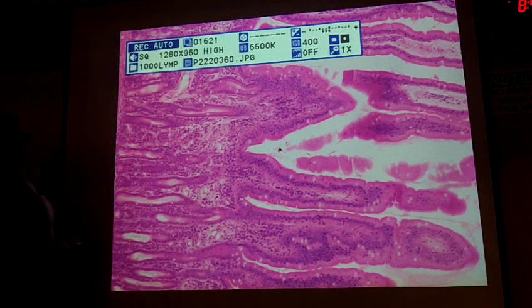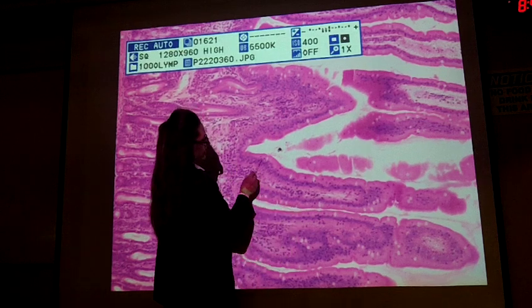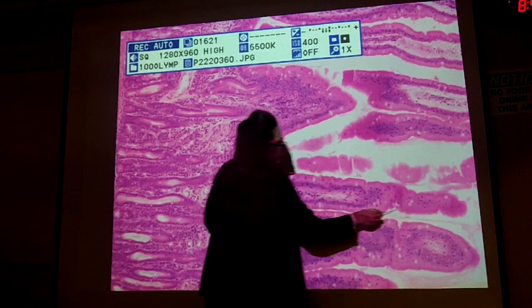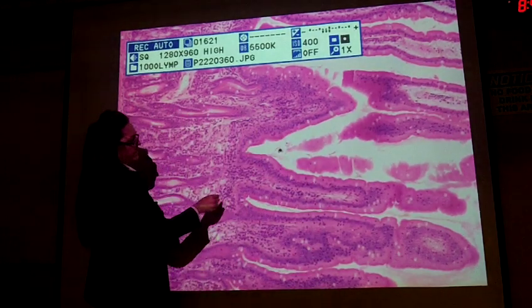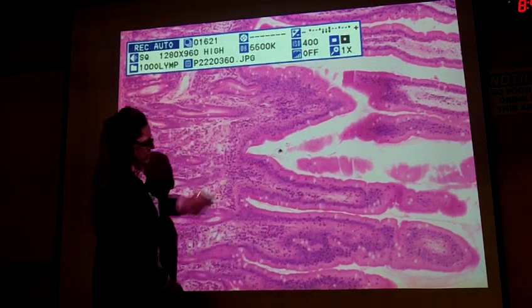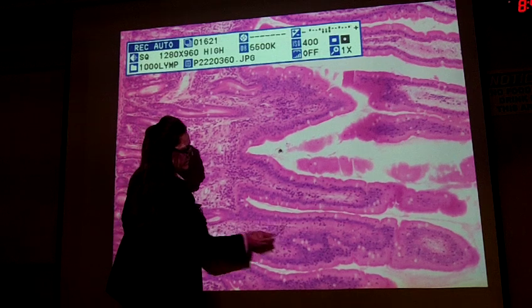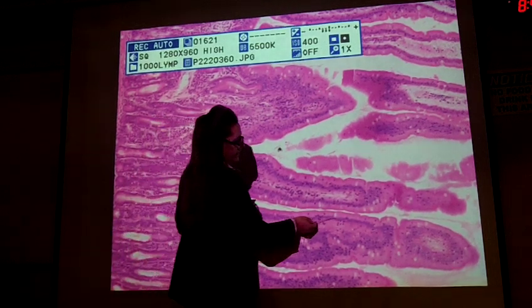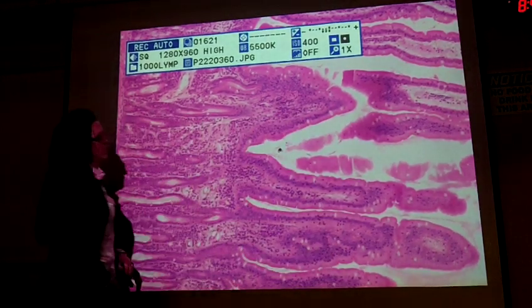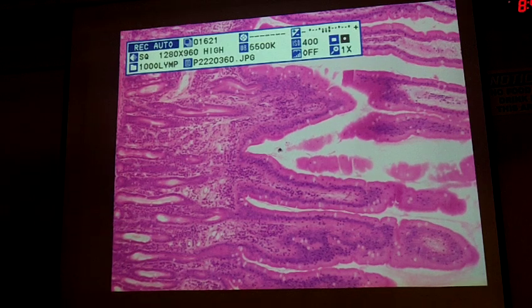and you can see these villi here. These are simple columnar epithelial cells, right, coming out like this, and then going around this. And here in the middle would be blood vessels and lacteals. So this is simple columnar epithelia, like this. You can see the nuclei here. It's all around like that. So those should look like real distinct finger-like projections.